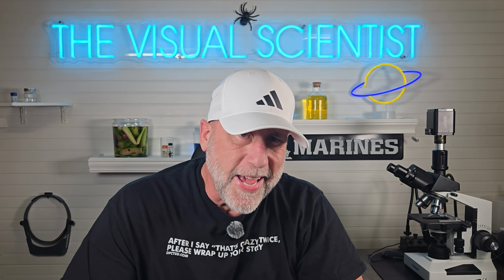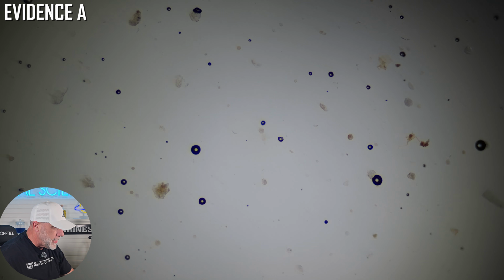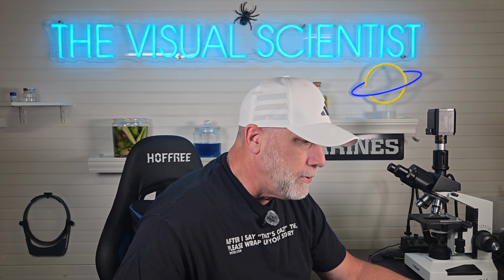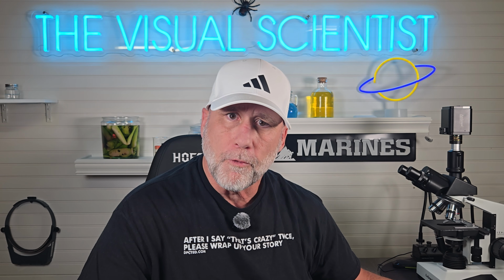Let's start with evidence A as an alpha. Evidence A, 40 times magnification. Let's do this, you guys. You ready? Fluid, amber, completely consistent at this level. Normal looking. Let's go ahead and move this up to 100 times. I'm starting to see some patterns forming at this margin. Let's push it up to 400 times.